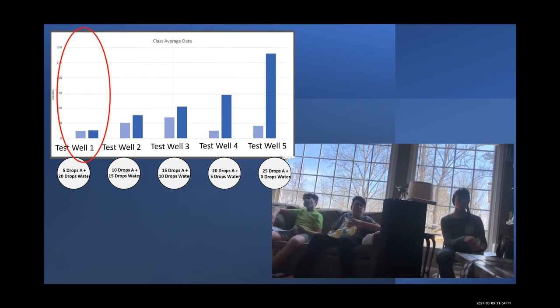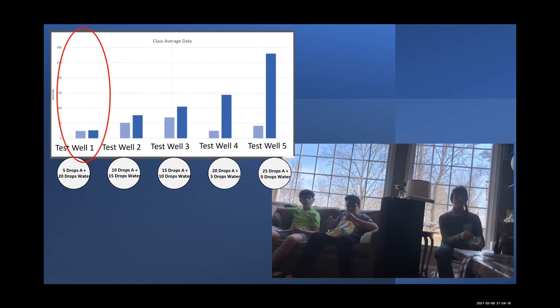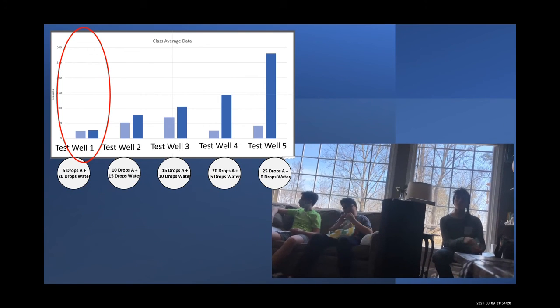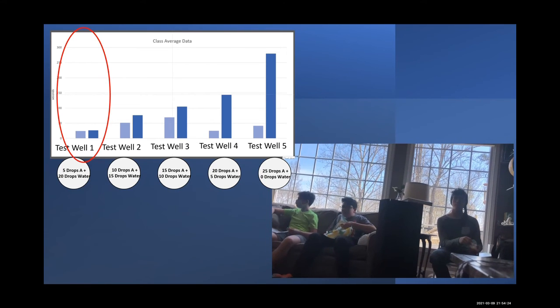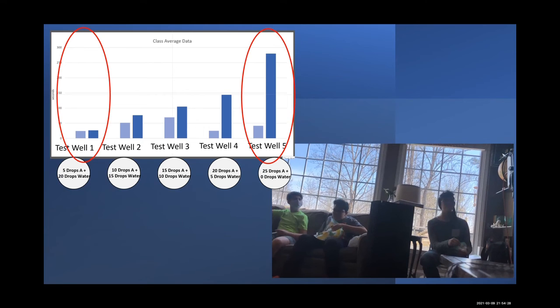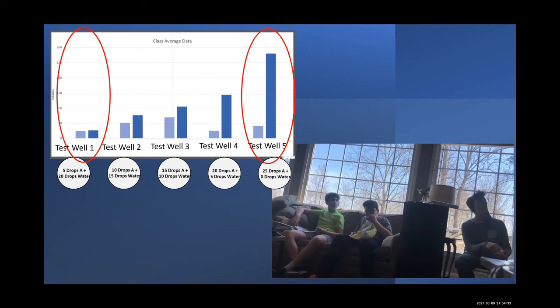This was way more dilute because it was 5 drops of solution A to the 20 drops of water. So because of that, it finished more quickly. It didn't have as much to do, basically. And in this case, it took longer because there was more of it to be consumed. Does that make sense? All right, does anybody have any thoughts on that?